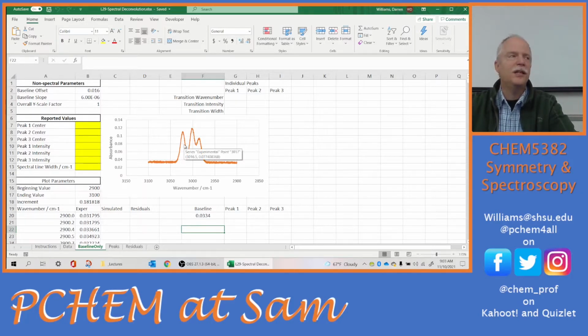Not that much information in the peak width. Is it not on? How about that? Yeah. All right, very good.